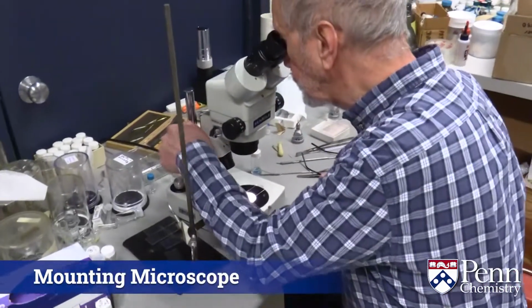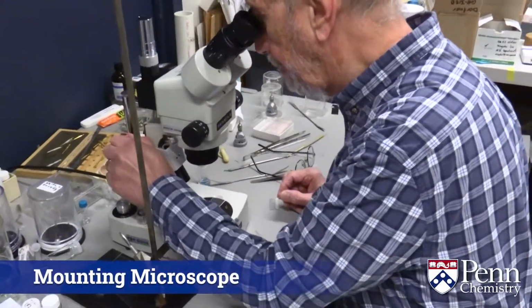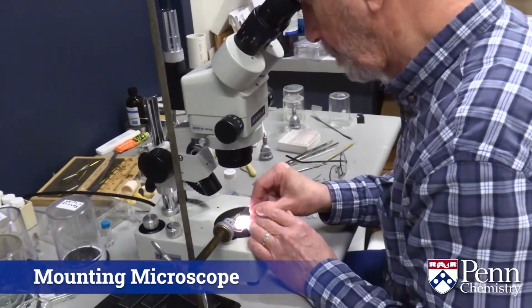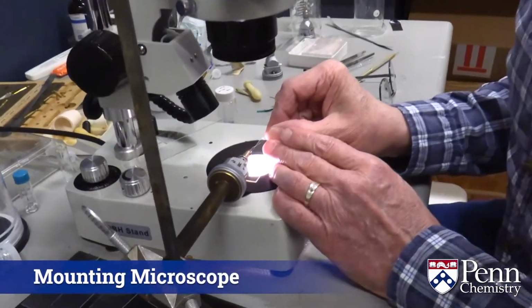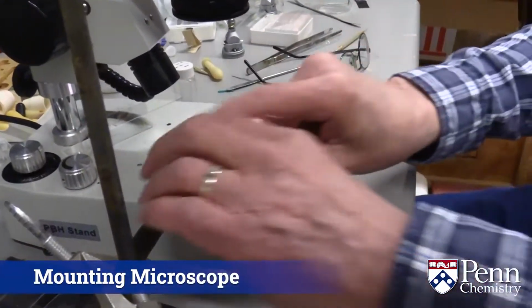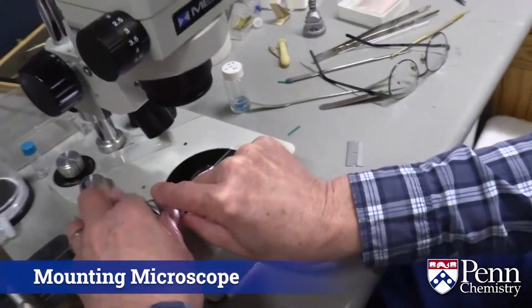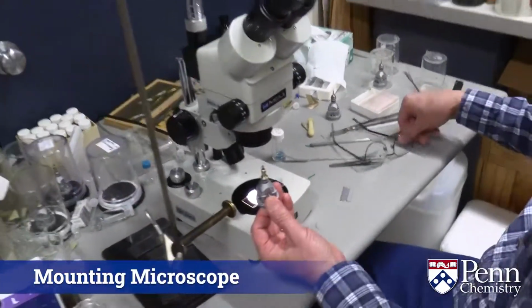The process starts over on the mounting microscope. The reason we have to use this microscope, of course, is these crystals are pretty small, and they are on a glass slide in some thick oil so that we can work with them, and sometimes they have to be cut down to size. But at any rate, they have to be dipped out of the oil and put on the tip of the goniometer head in order to have it fastened for attaching the goniometer head to the instrument.